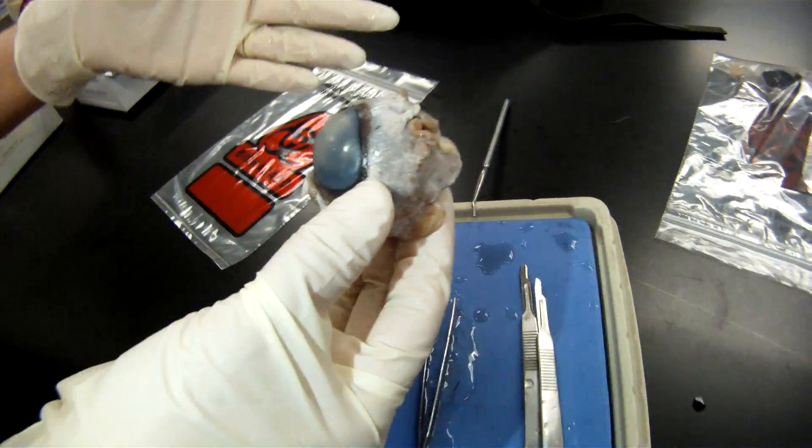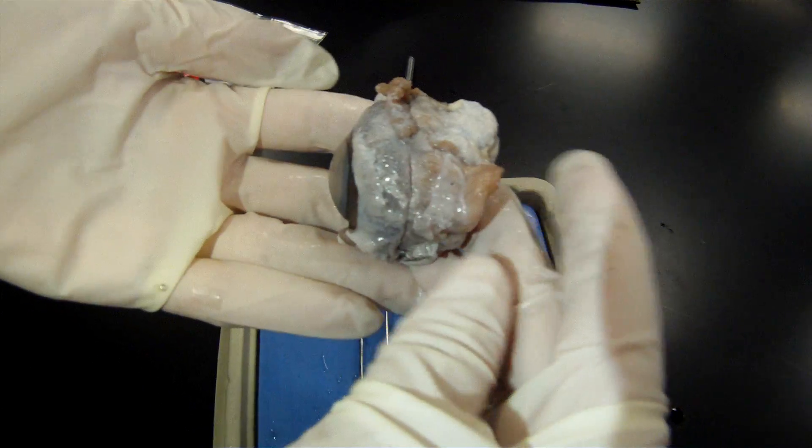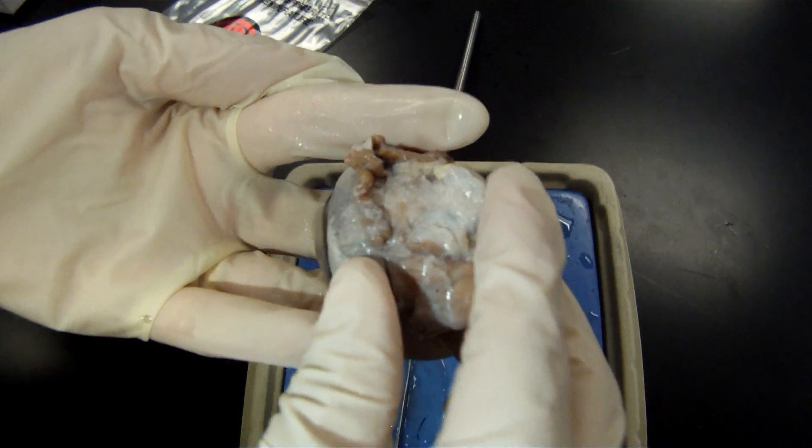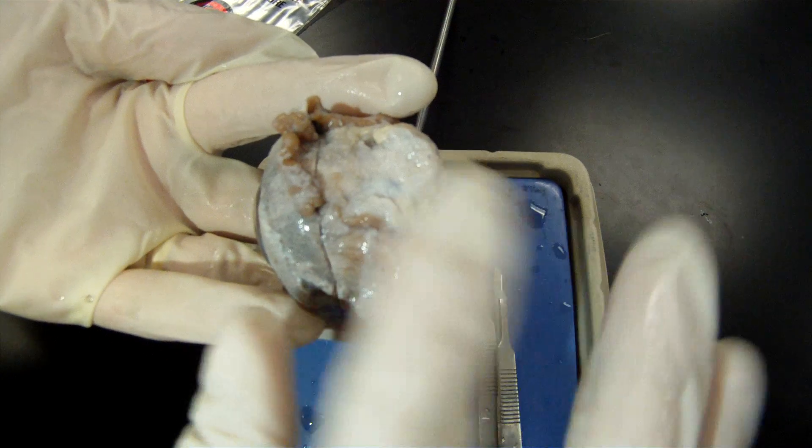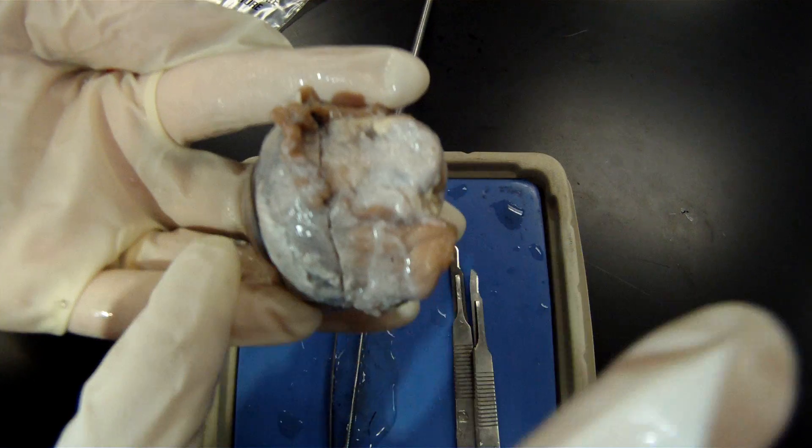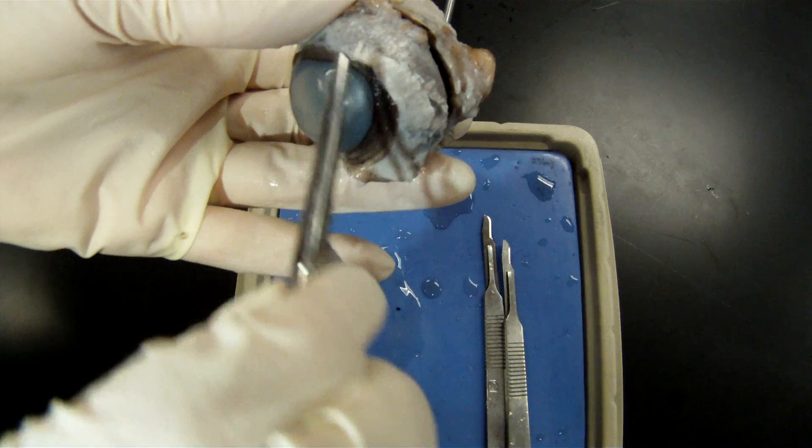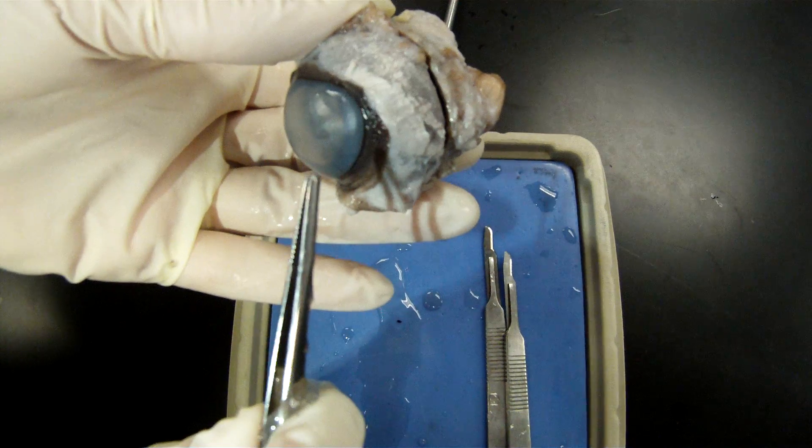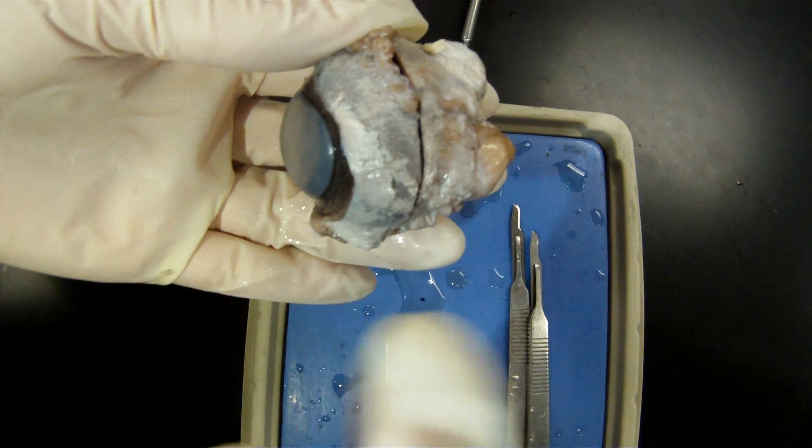This is where the lacrimal gland would be. Okay, we're live. So this is the outermost portion of the eye, or outermost layer: sclera and the cornea. This area is bulbar conjunctiva. The lacrimal gland is not here because that's underneath the eyelid.